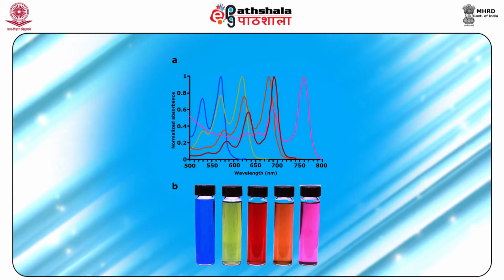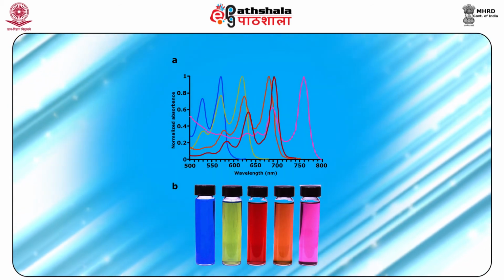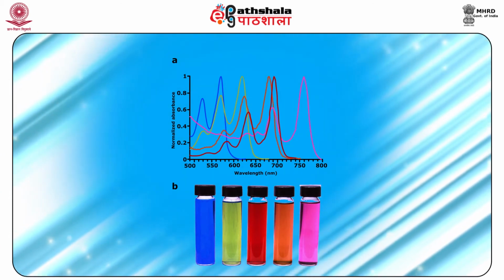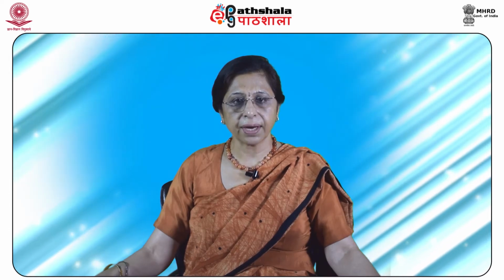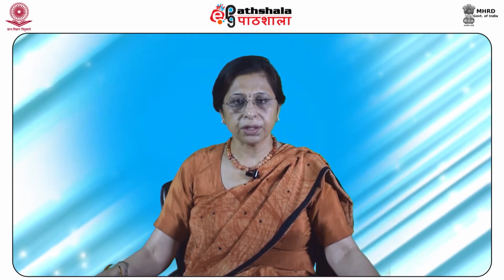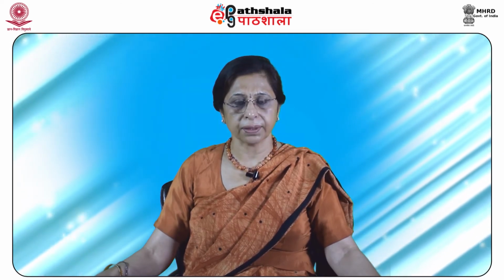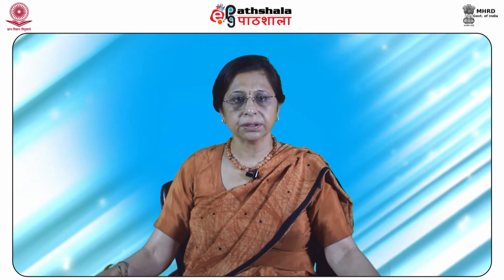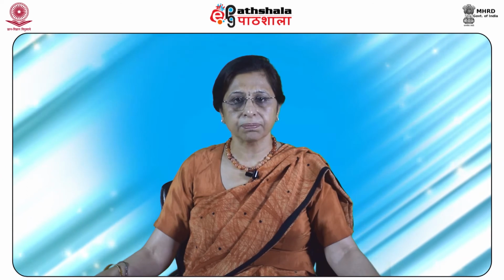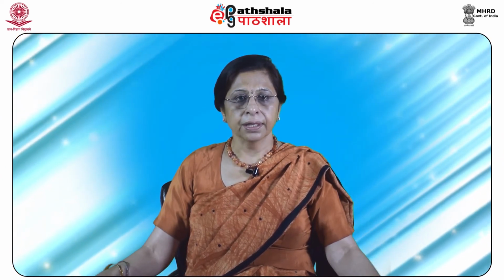The fine structure of absorption bands is first blurred due to interaction of the solvent and the solute molecules. This effect is more pronounced in the case of polar solvents as compared to non-polar solvents. The fine structure of UV/visible spectra is best observed in the vapor phase.